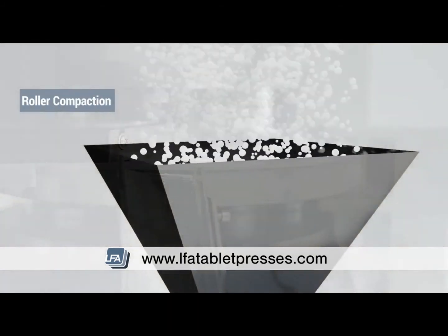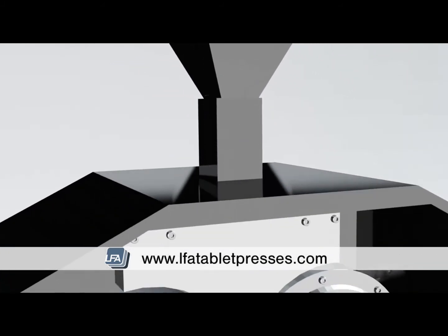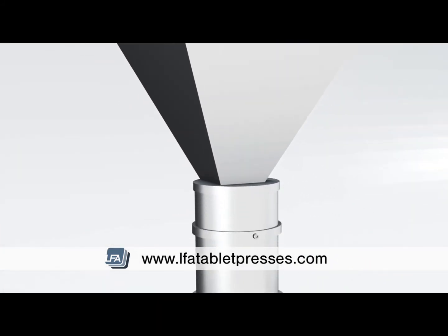Whilst reading about dry granulation, you may have also heard of roller compaction. Roller compaction is where your formulation is fed through a roller compactor. Your mix is fed through the top hopper, where two rollers will compact the powder to form a ribbon. This would then pass through a granulator where the powder is forced against the mesh, which creates the granules of the desired size.